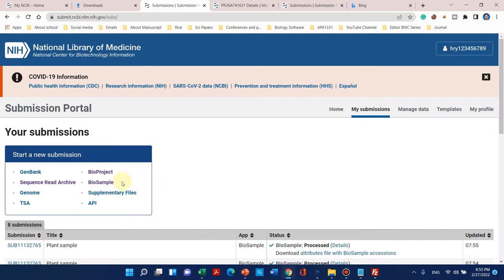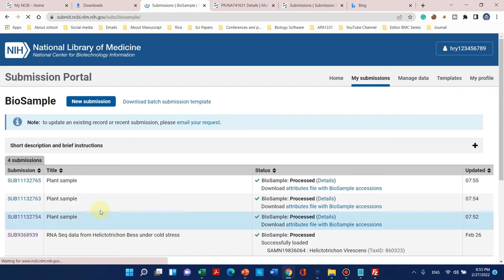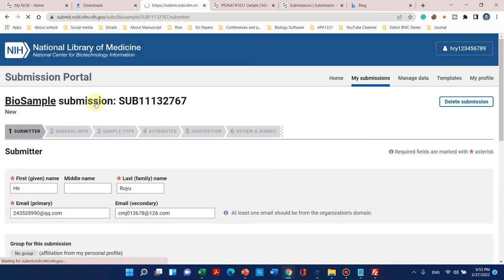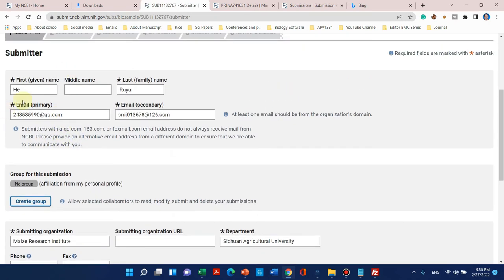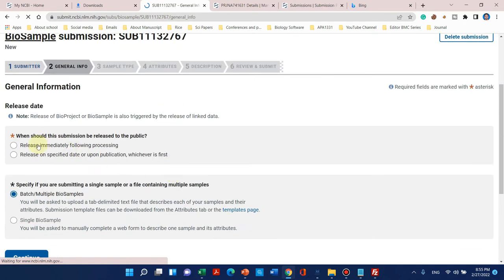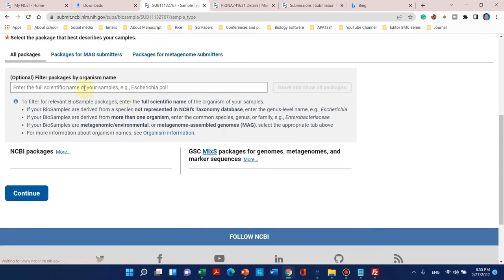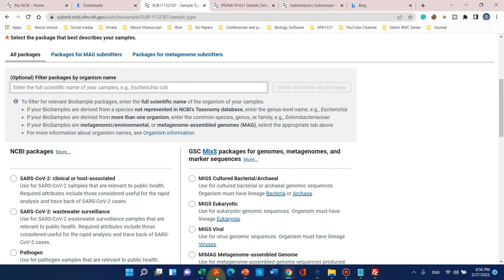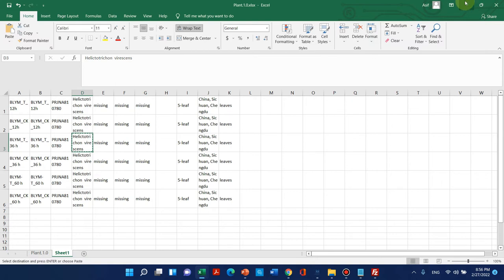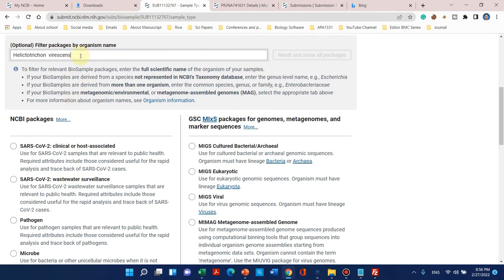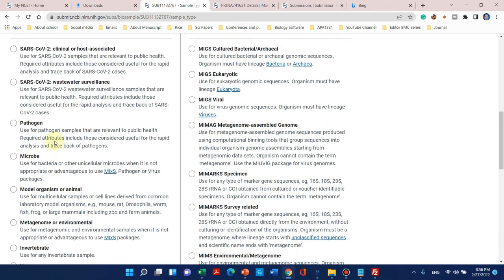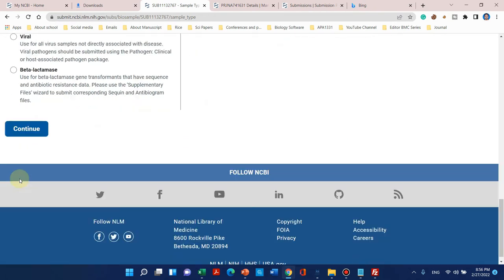Now we will move to our fourth step: BioSample submission. We will click on BioSample and start a new submission. The submitter information is the same as before, so we can leave it as such and continue. Here we can choose the release date and specify batch or multiple BioSamples. We can paste the name of the organism — for our case, we copy and paste it. From the list we can choose which sample type — because this is a plant, we choose the plant option and continue.